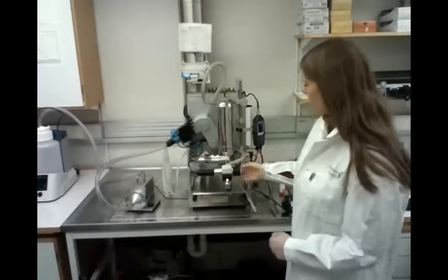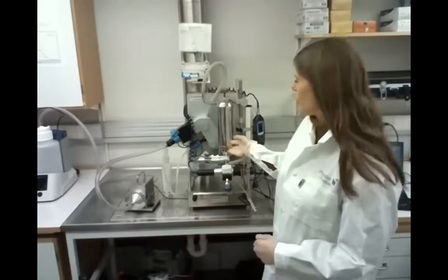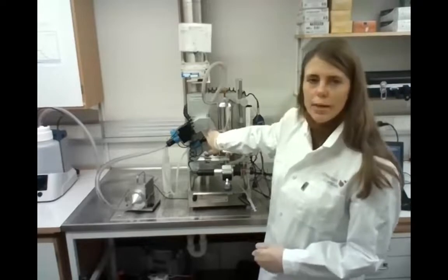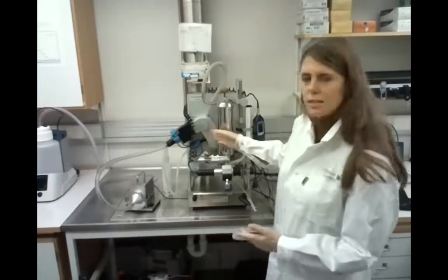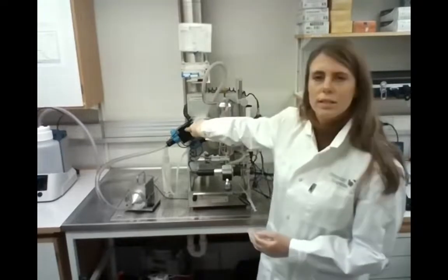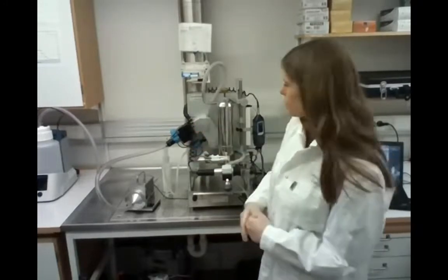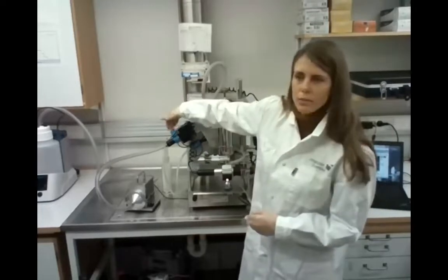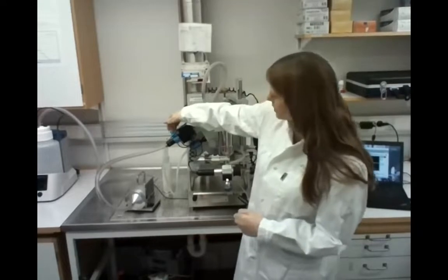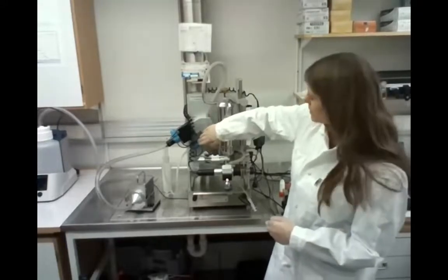Yes, so my name is Beatrice, and I will show you the PreciseInhale setup with the dissolution chamber and also with the inhaler generation. So this is the holding chamber for dissolution. Behind this plate, we have a pinch valve that either directs the air in exposure flow or in a bypass flow. Here, this one is an overflow protection filter, which protects us from potential overflow of the particles. Behind this, we have a blue pneumotach. This is a pneumotach that is measuring the inhalation flow. And then we also have a pneumotach over here, which is measuring the exposure flow.